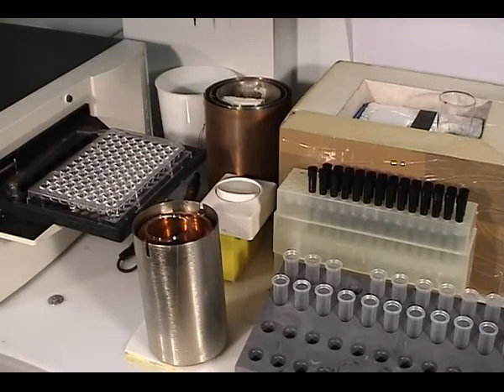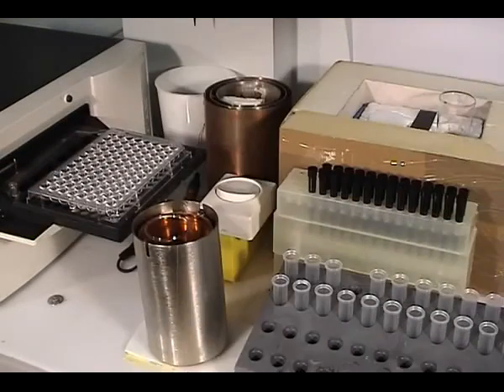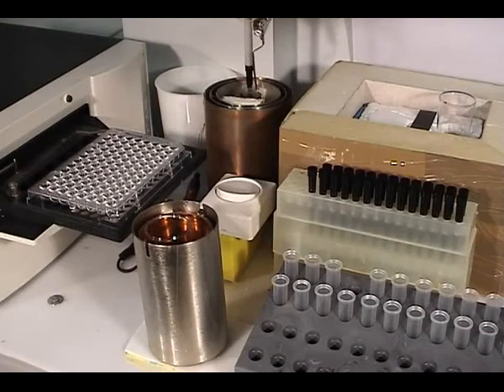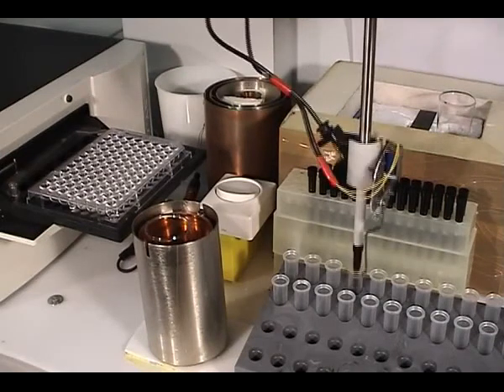Now four signals have been played. There are two water and two heparin that are coded. So the operator and the machine don't know which is which.